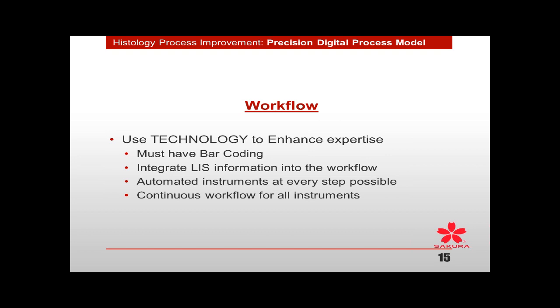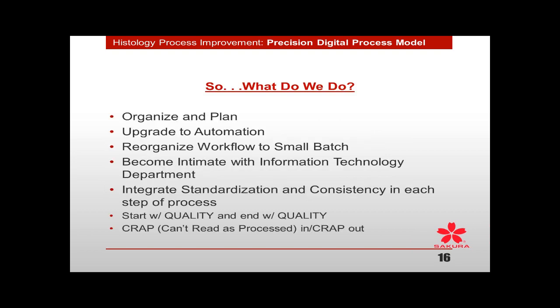I'm real confident that if you're not moving to small batch, you're losing half-day increments of your turnaround time. If you're lucky, maybe you lose a half day, and maybe your system is built around that, so you can incorporate that half day and not really truly affect the overall turnaround time. But most often, losing half-day increments move into full-day increments, and in my world, that's not acceptable. You're going to have to work within the set time constraints. So you've got to develop a small batch continuous workflow for all of your processes and instruments.